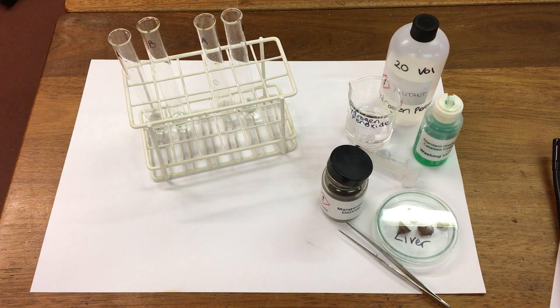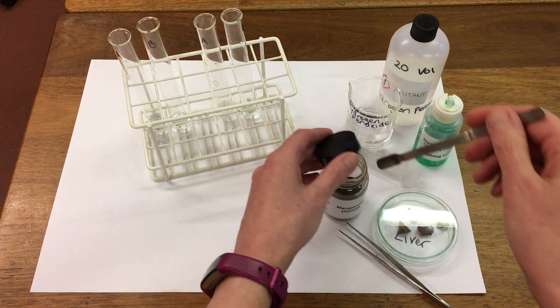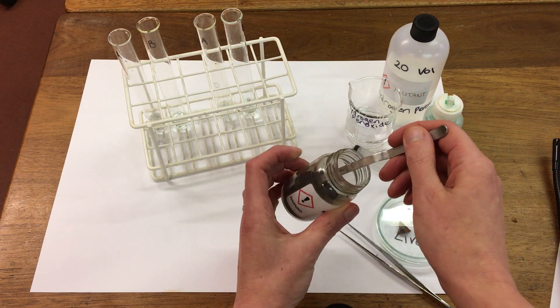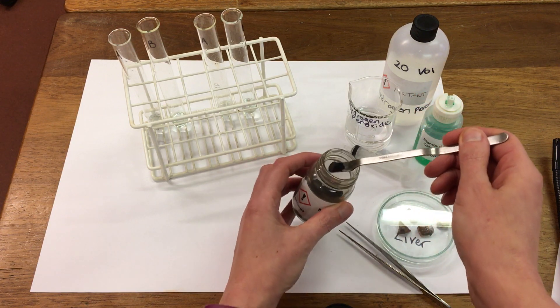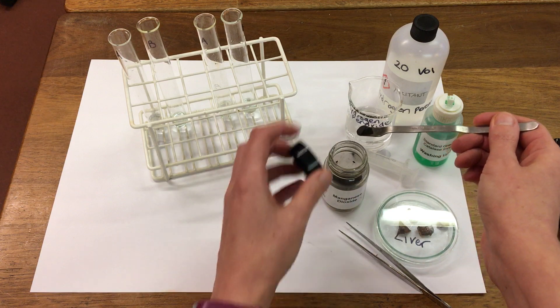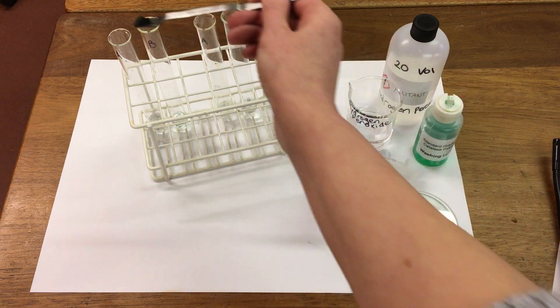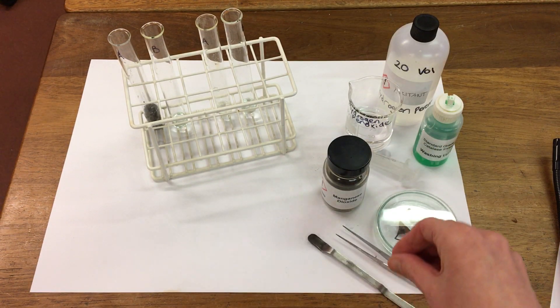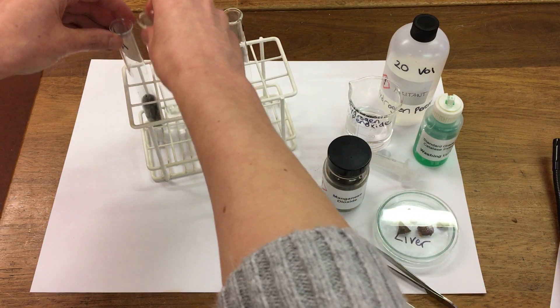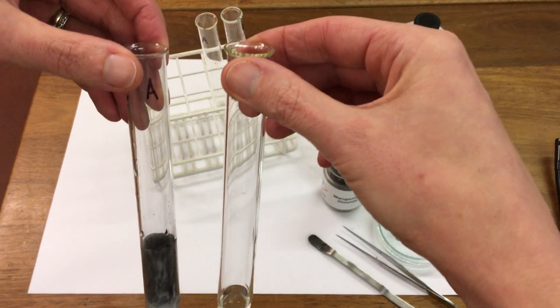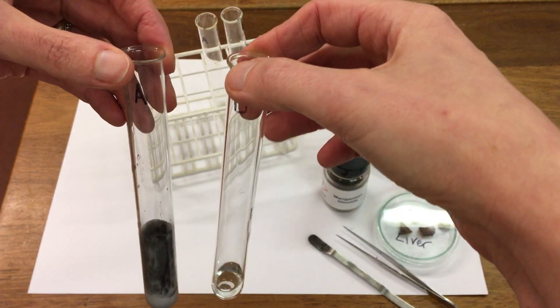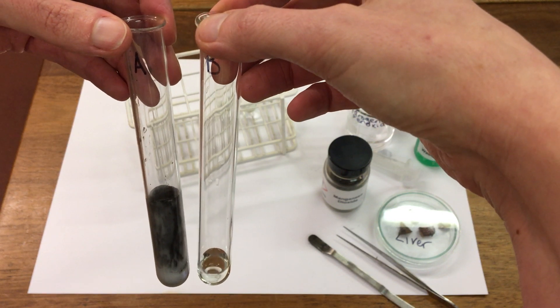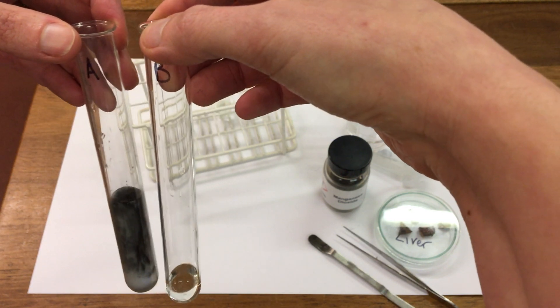So in our first set we're going to add the catalyst manganese dioxide and compare it to a blank with no catalyst. So this one has our catalyst and we can see the foam being produced and this one with no catalyst.